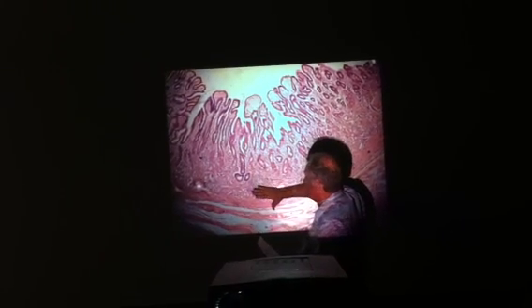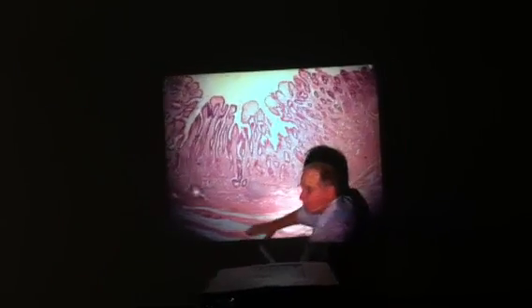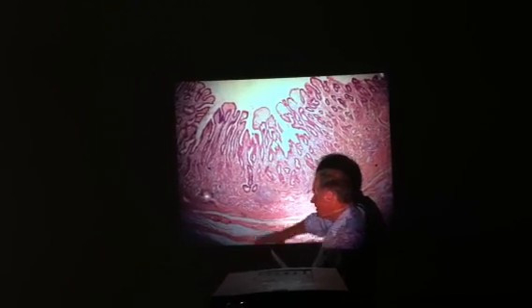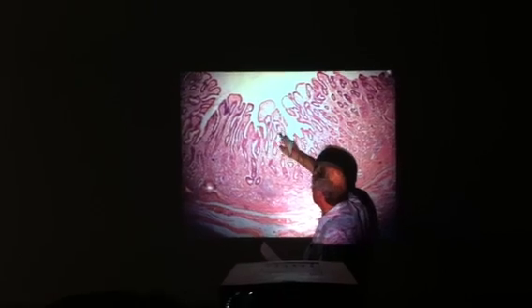Then, which we can't see on this slide well, I don't ask you on this: submucosa, serosa, and all that. That's down below. But this area out here, I have asked if you see a pit.